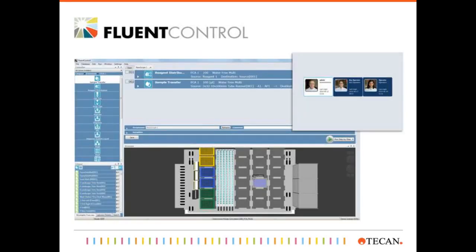At the bottom, I'll click on that so that I can see the list of labware that I'm allowed to bring out. We'll place a 96-well plate here, but this could be any labware. And now I'll bring out the first of our smart commands, a reagent distribution command.